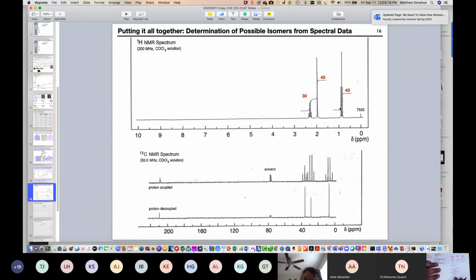Okay. So we had 4 unique types of carbon. 3 are sp3 hybridized, right? 1, 2, 3. 1 is sp2 hybridized. But we have further resolution of these, right? We have 2 CH3 groups and 1 CH2 group.